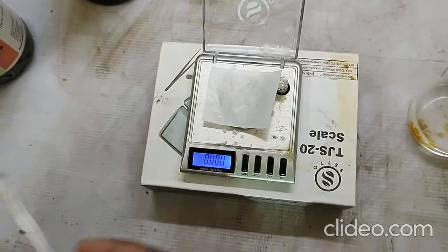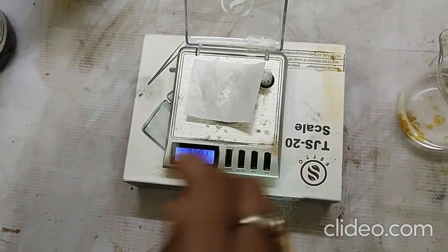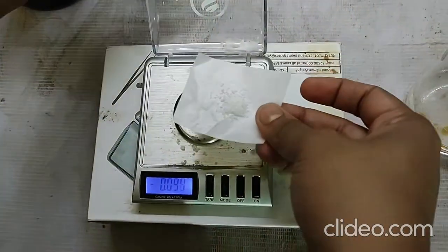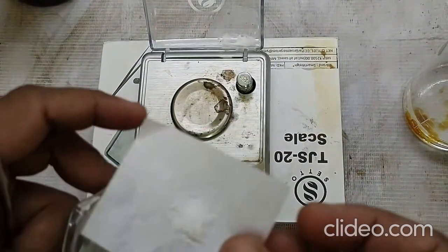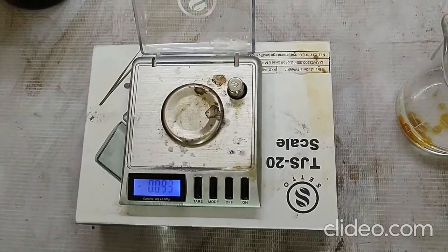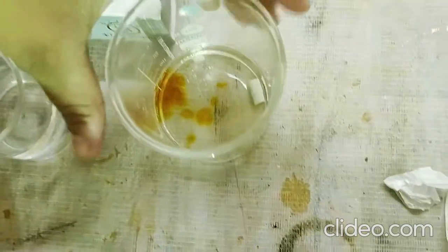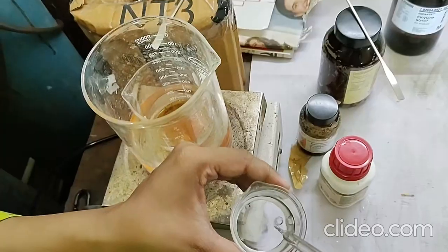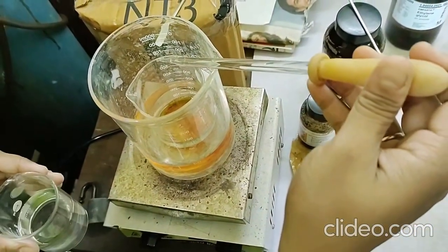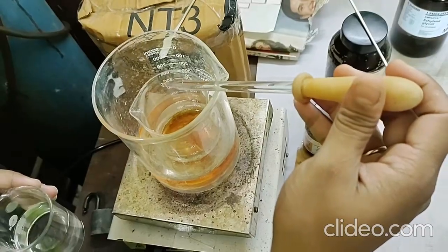Next we have to measure the KBr. This KBr is added to 60 ml water, and then stirred properly to mix the solution, and then this KBr solution is added dropwise to this ethylene glycol solution, which is already placed on a magnetic stirrer and in a water bath at 80 degrees Celsius.